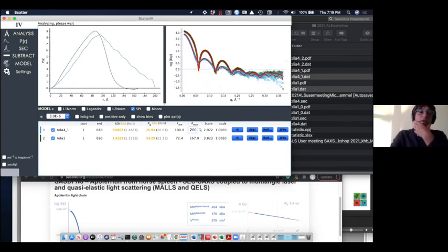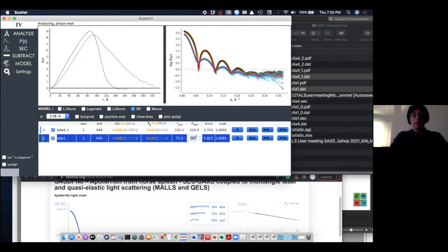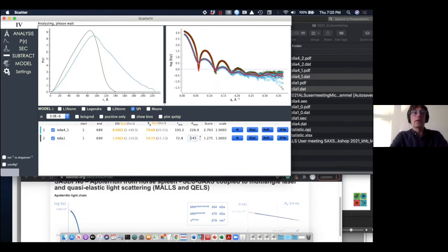The scattering profiles are very similar across the peak. That indicates probably a stable complexation and not a partial complexation. Also this PDDF, the pair distance distribution function, is the main information you can probably get. You see the huge difference between apoferritin itself and the complex of apoferritin with DFLB or some kind of antigen. All this information is just the initial analysis.